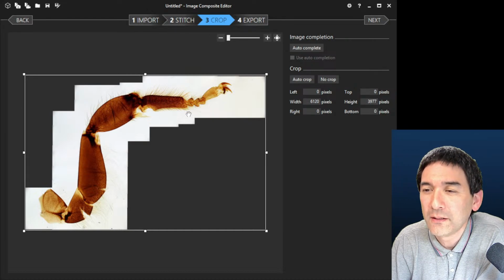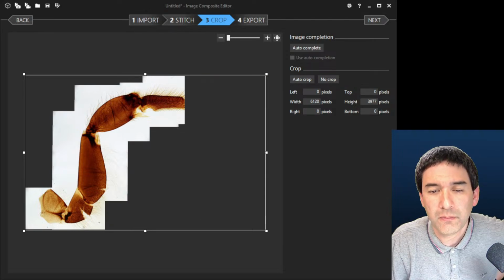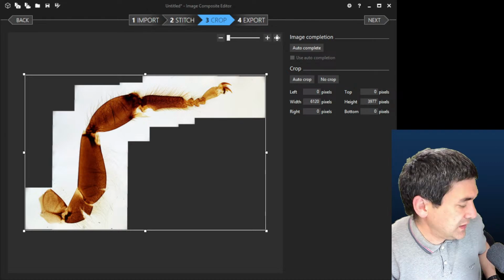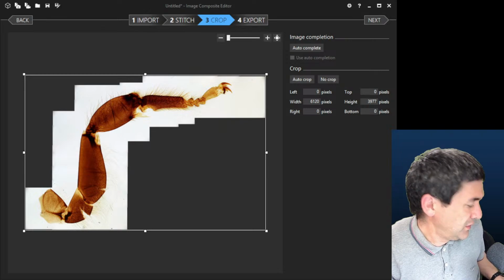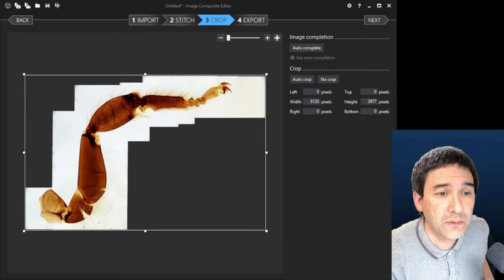Does this work with Windows 10? Even with your link I can't find the download itself. Really? Yes, it works with Windows 10. It's a fairly old program. That's interesting. Maybe you can try to. I mean, I see it here. Let me quickly check. I can post the link into the chat here. Actually, it should work. Let me try it.